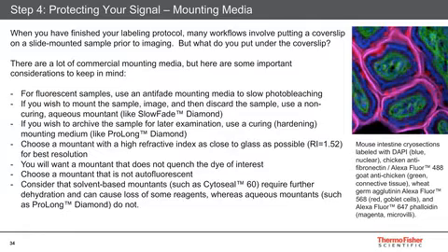And then consider whether or not you want a solvent-based mountant like Cytoseal 60 or HistoMount that we sell, or if you want an aqueous-based mountant like our ProLong Diamond. Usually the best choice is to go with an aqueous-based mountant. This is where you just move your samples from their last wash directly into the mounting medium without having to dehydrate or move your sample through solvents, as is commonly done with colorimetric dyes like hematoxylin and eosin. Fluorescent dyes usually don't do well with those dehydration techniques, so definitely, if possible, go with an aqueous mounting medium.